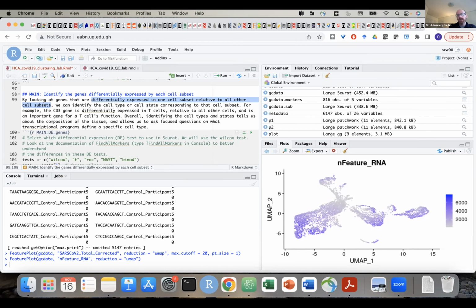Versus when a gene is highly expressed, it's still affected by technical noise, but we know that biologically it's probably on and being expressed. So that's a little easier to interpret when genes are more highly expressed in one cell subset relative to another. That's generally the type of genes we start by looking at: the ones that are high in one subset and low in all the others.